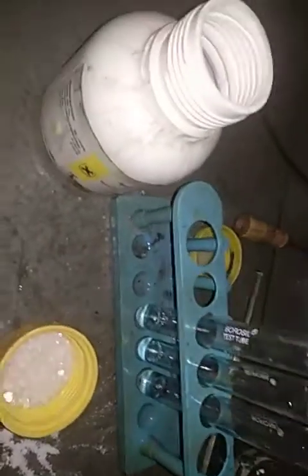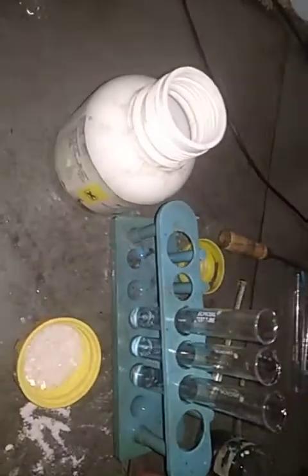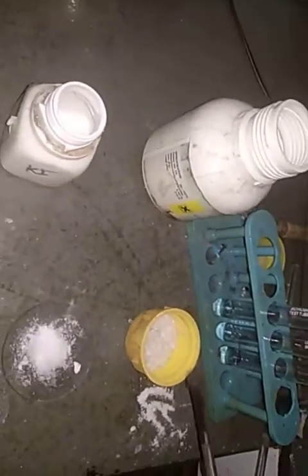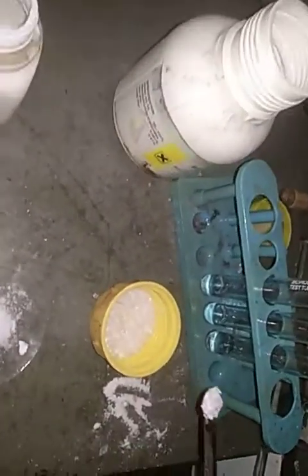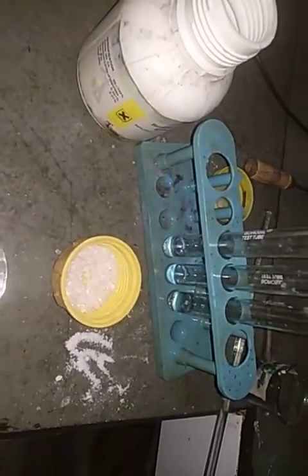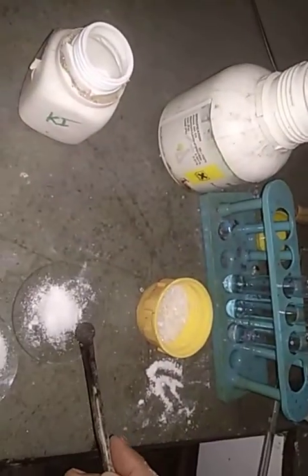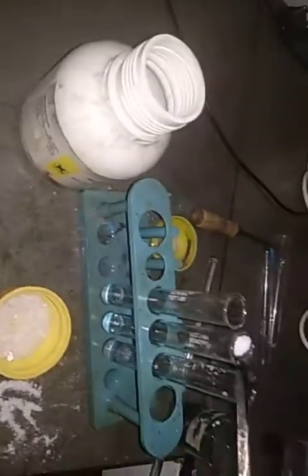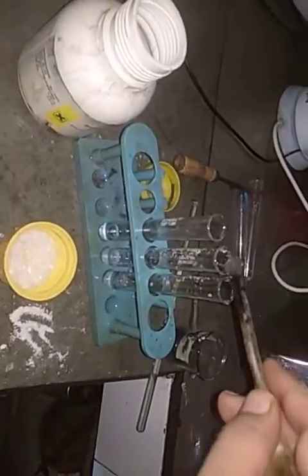So first we shall add our barium chloride to one of the test tubes. Then we shall add potassium iodide to another test tube, and then we shall add sodium chloride to the third test tube, and let us try to dissolve them.